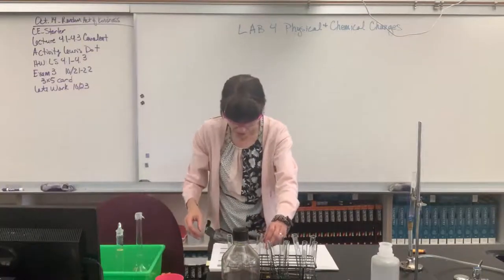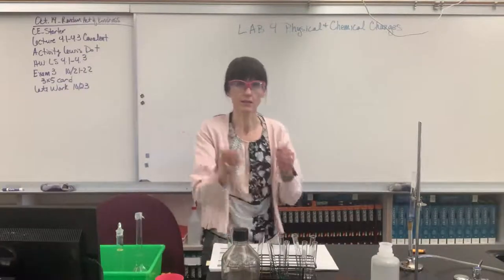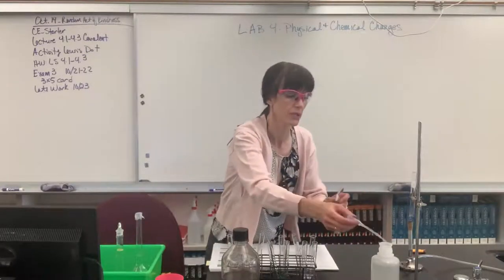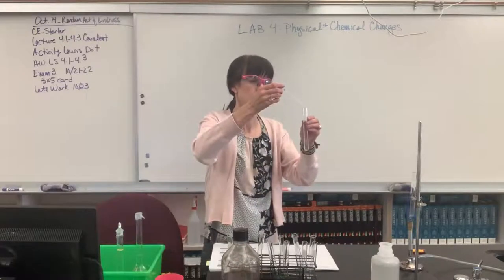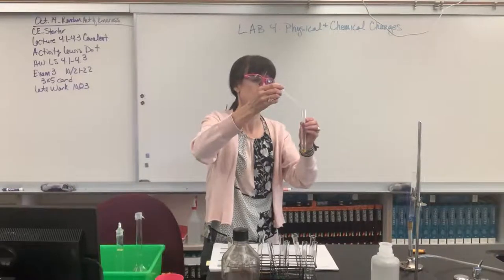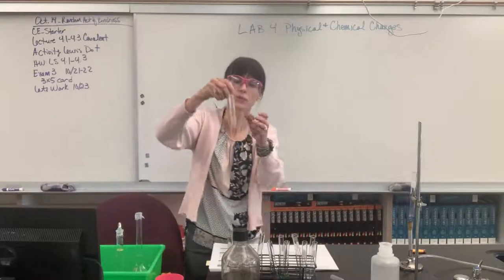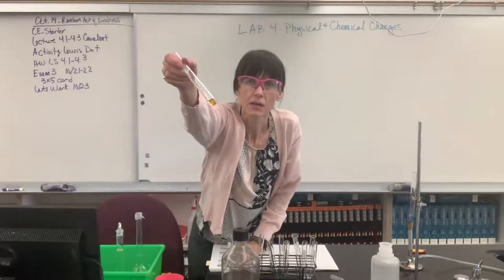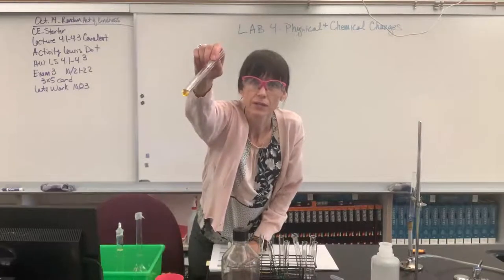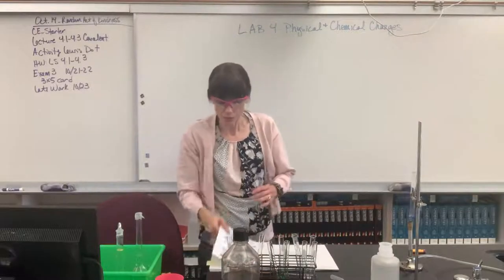Add 30 drops of distilled water to one of the solid samples prepared in step one. So let's get our distilled water and count 30 drops. Here we go. 1, 2, 3, up to 30. Okay. So you can see the yellow. There's that yellow color. I'm trying to rotate it, hoping that you can see that yellow color. Really pretty. Let's record that.